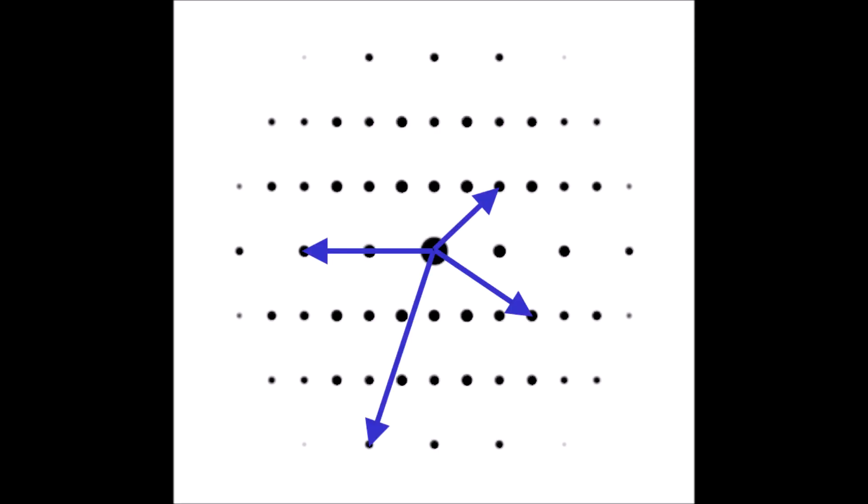So what I can do then is using my direct spot as an origin, I can draw a vector that starts at the direct spot and points to any of these Bragg spots. And so we call these G vectors in the diffraction pattern.